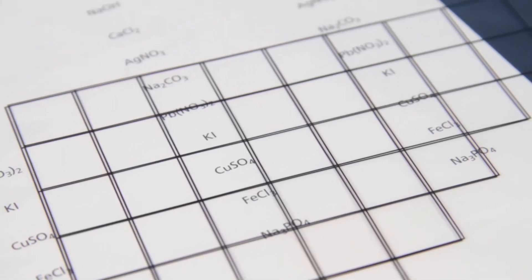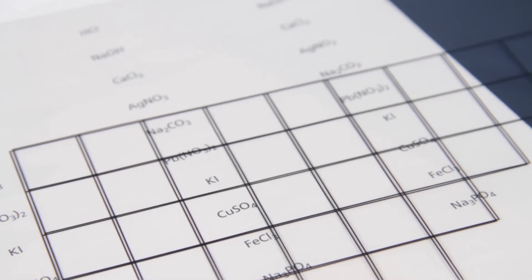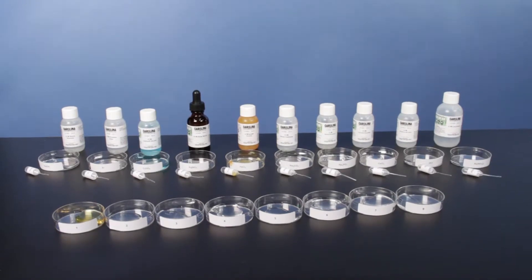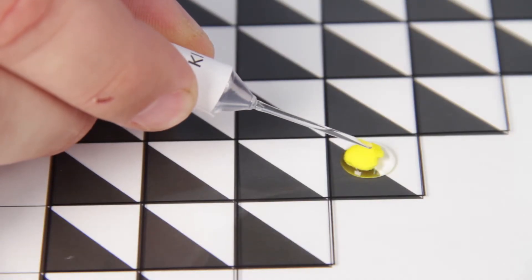Carolina Chem Kits reduce teacher prep time with detailed setup instructions and ready-to-use chemicals. Cleanup and disposal hassles are also reduced with small volumes and green chemicals whenever possible.